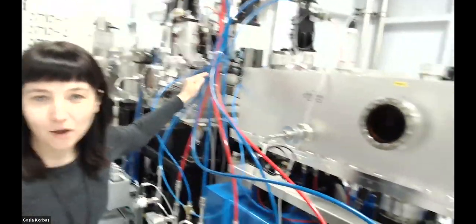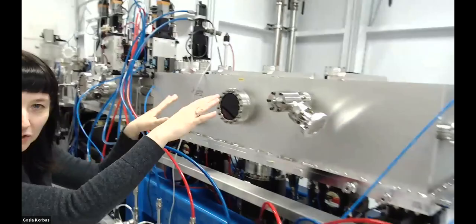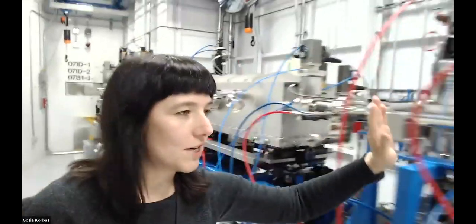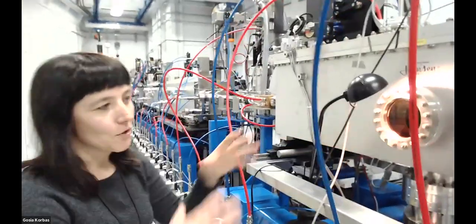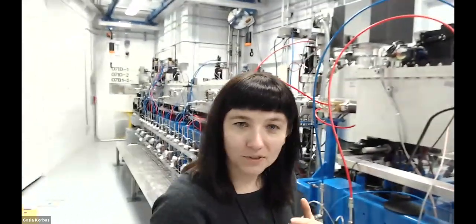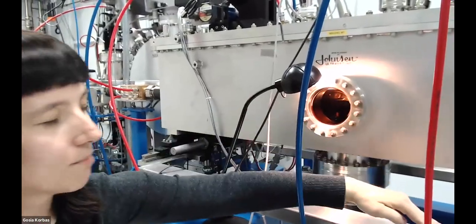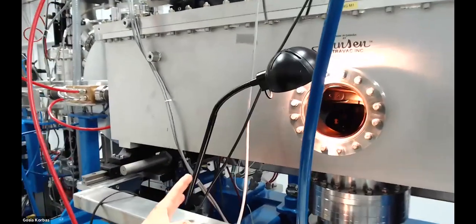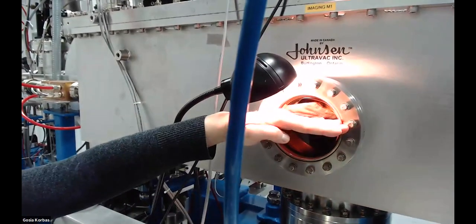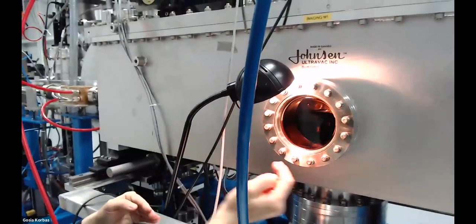So now the beam for the BioXAS imaging would just pass through some mirror tanks, but it's not interacting with those mirrors. The mirrors are for the other beamlines. So the beam is just passing through, not interacting with anything up to really here. So this is the first mirror, and we're talking about a 1 meter long silicon slab covered with a rhodium coating. This is a downbound mirror, so as the beam comes, it reflects the beam down. And the beam is still quite powerful here. That's why you can see this browning on the glass slide, but only half of it, because the mirror is positioned this way. And the light comes down and scatters this way as well. It doesn't scatter that way because it's blocked.